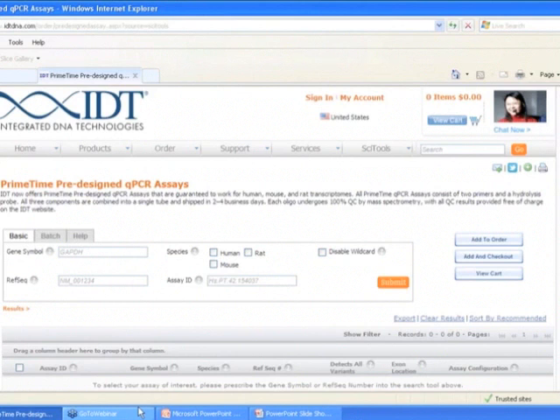One other question then: what is the ideal DNA or RNA purity for a good qPCR experiment? Normally people look at RIN numbers, and a RIN number greater than 8 is definitely good.